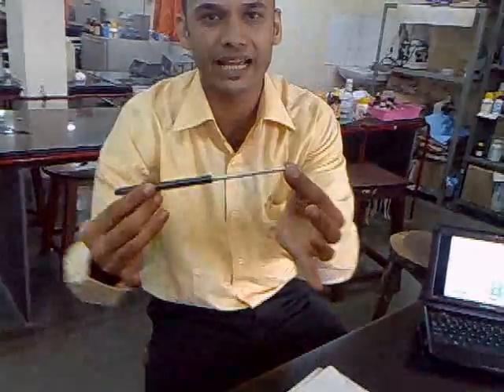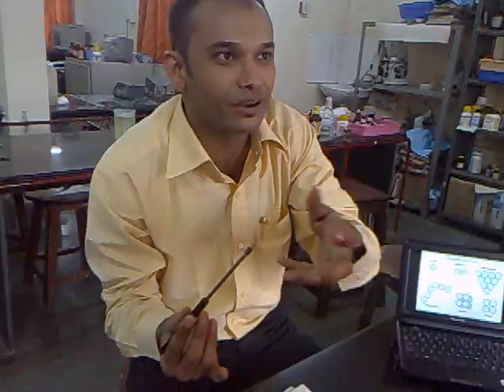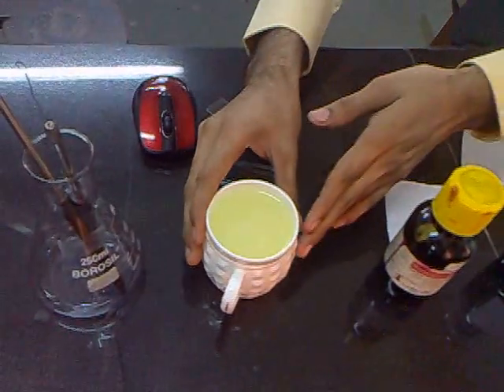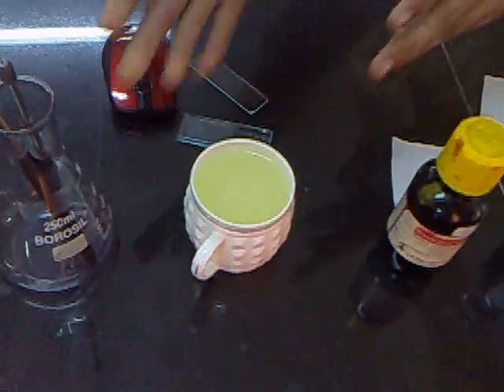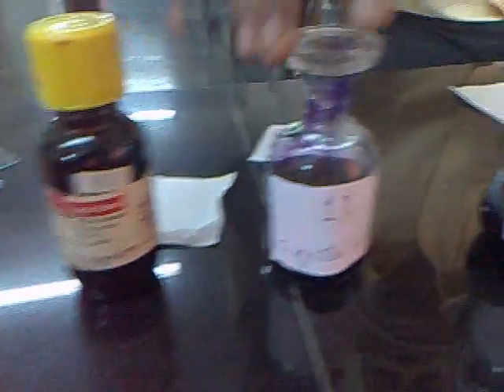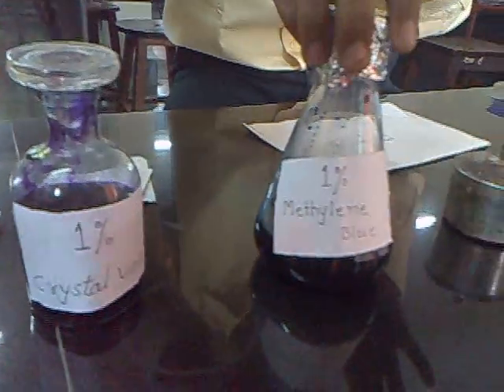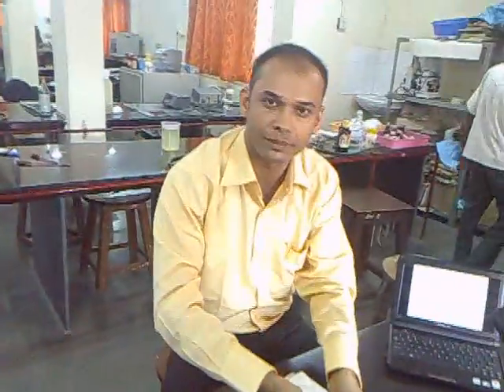Let's talk about what are the requirements of this particular experiment. This is called a nichrome loop. This instrument is called a nichrome loop because nichrome is a metal and it contains a loop. We also have a culture sample — this is curd water, because curd water contains bacteria, I am going to use this as a source of bacteria. These are the three stains: the first one is carbol fuchsin, the second is crystal violet, and the third is methylene blue. This is a burner and this is a matchbox.